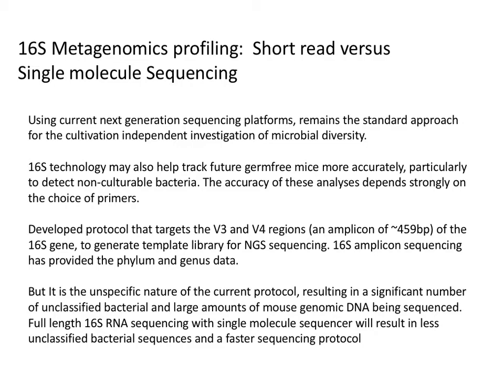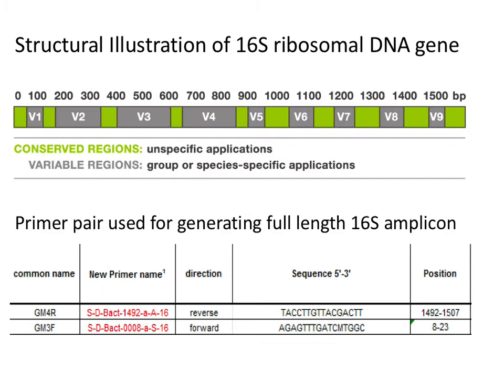we get from the Illumina short read, and that's only doing the 16S, which has nine variable regions. We're only looking at V3, V4 with the Illumina, so in fact, it means that if there is no variety in those, a lot of the reads go to unclassified because it hasn't seen those changes before. If you're able to do the whole 16S, you get more information. If you're able to do the whole genome, you get even better information. So doing V3 and V4 is still very limited.